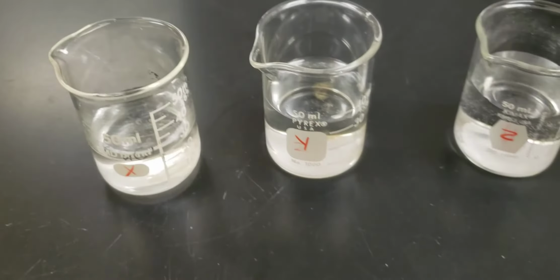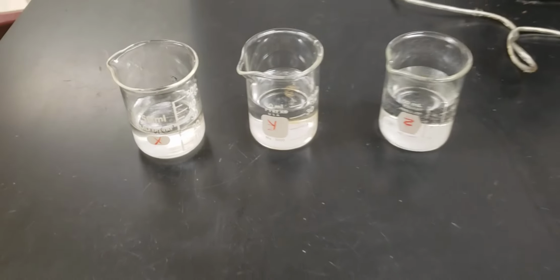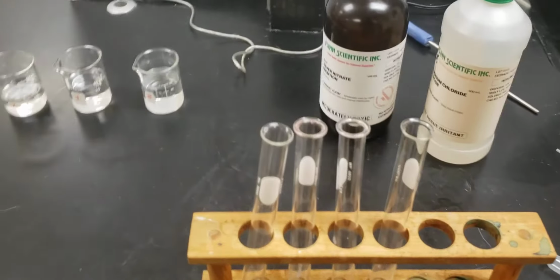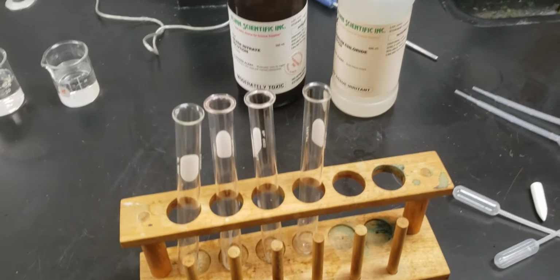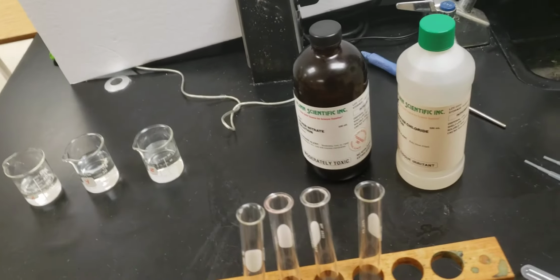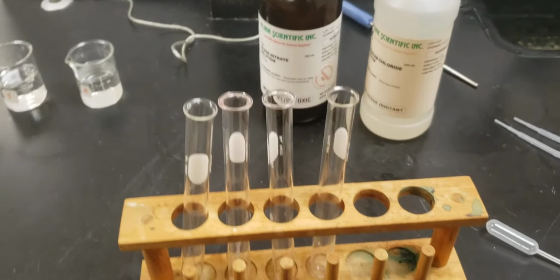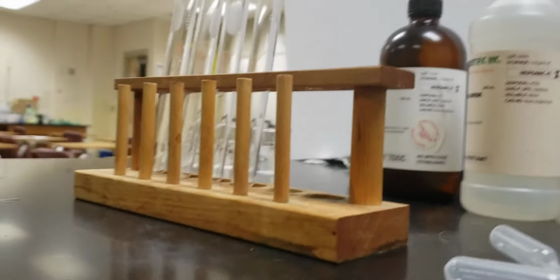We are testing the halide content of X, Y, and Z. We're going to do this by adding silver nitrate and then ammonium chloride. In this particular lab, since we are evaluating three different solutions, we want to make sure that we are being good with our lab procedures.